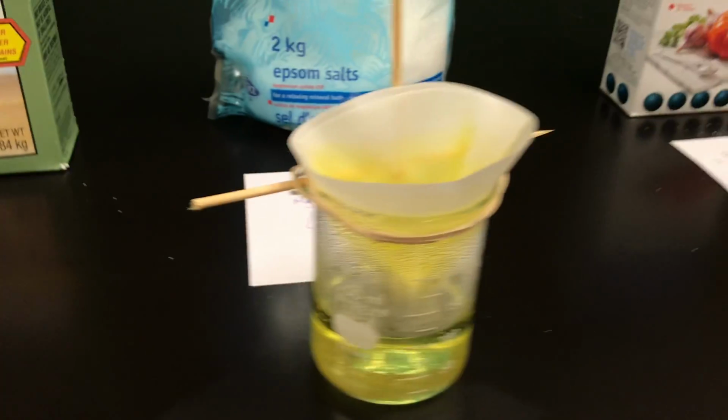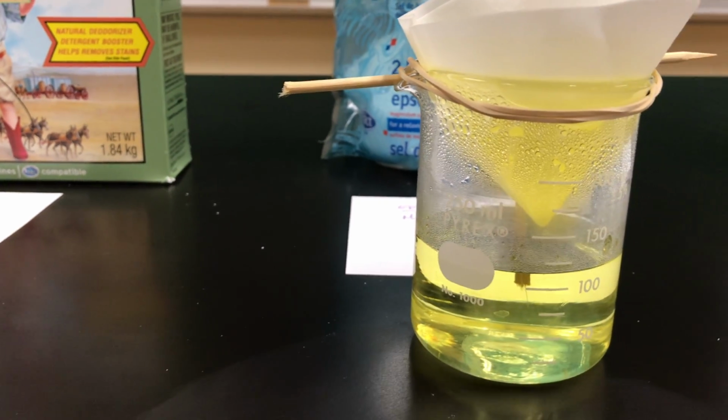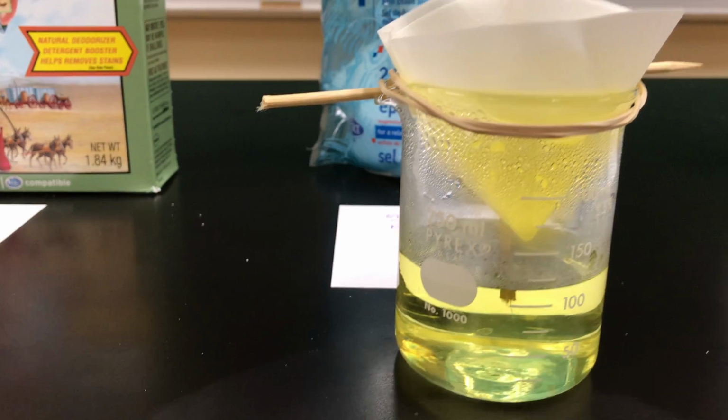The Epsom salts were the last ones that I did. They're still filtering a little bit. I did dye that one as well. I've got my nucleation point in there. You can see it's just dripping and finishing filtering.